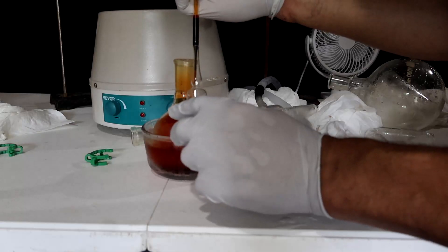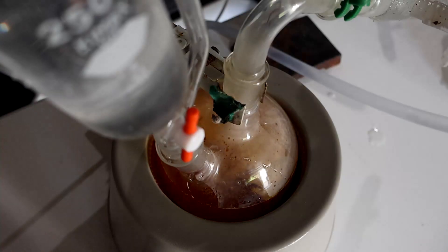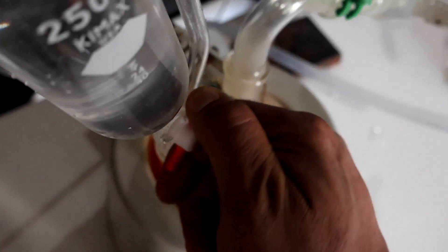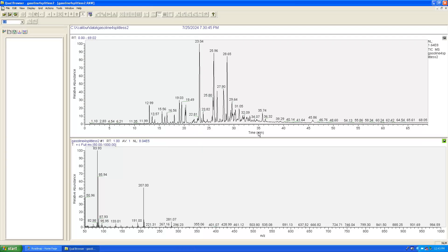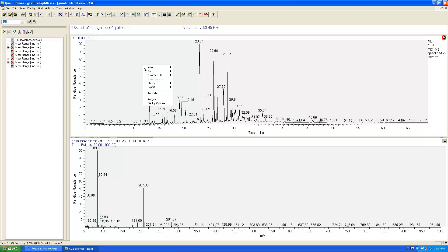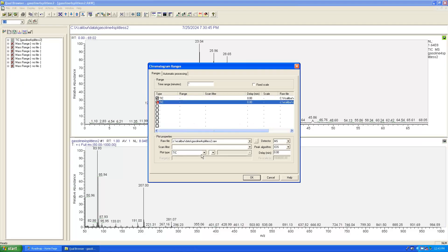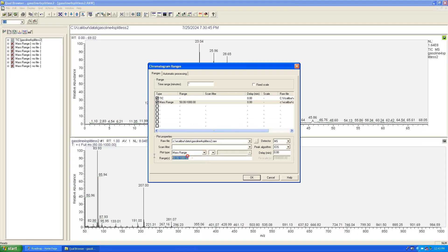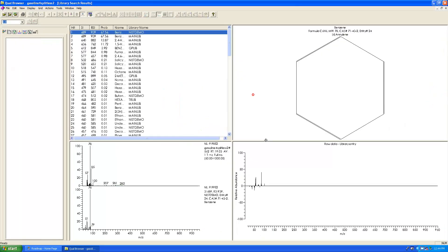Just a quick trick I learned recently: if I'm looking for a specific compound after an analysis, select the chromatogram and access the range. The software allows you to select the mass range you are interested in. For example, here benzene in gasoline at mass 78 — there it is, pre-selected in the chromatogram. I think it's very cool.